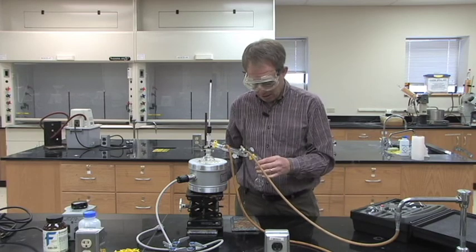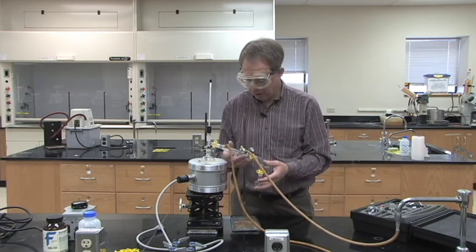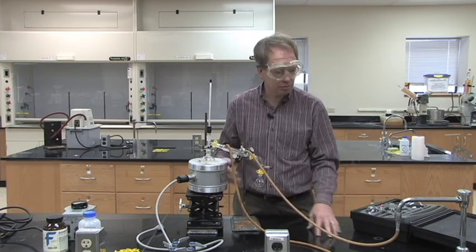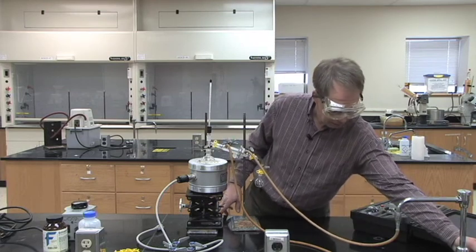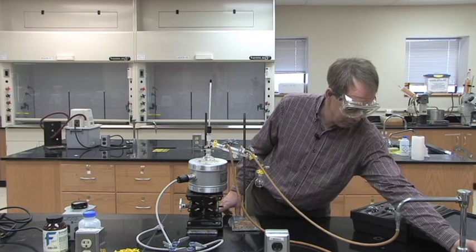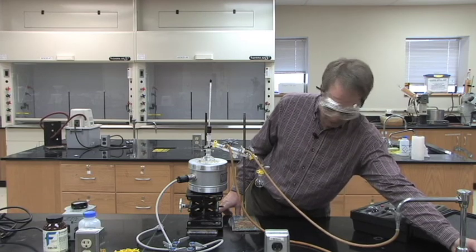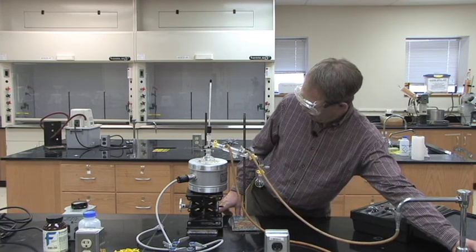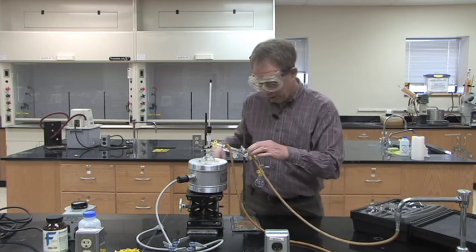When you turn on the sinks, it'll invariably happen that somebody in the lab will turn it on too high and they will end up splashing somebody in lab. It's okay if it happens. But as you turn on the sink, just turn it on a little bit.